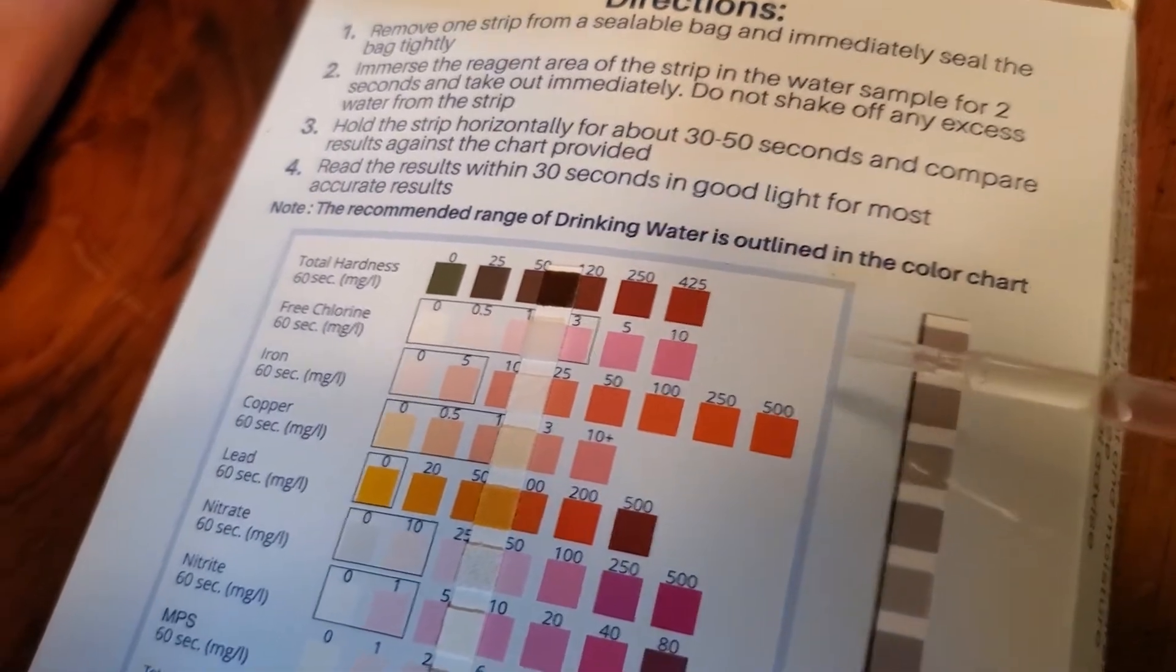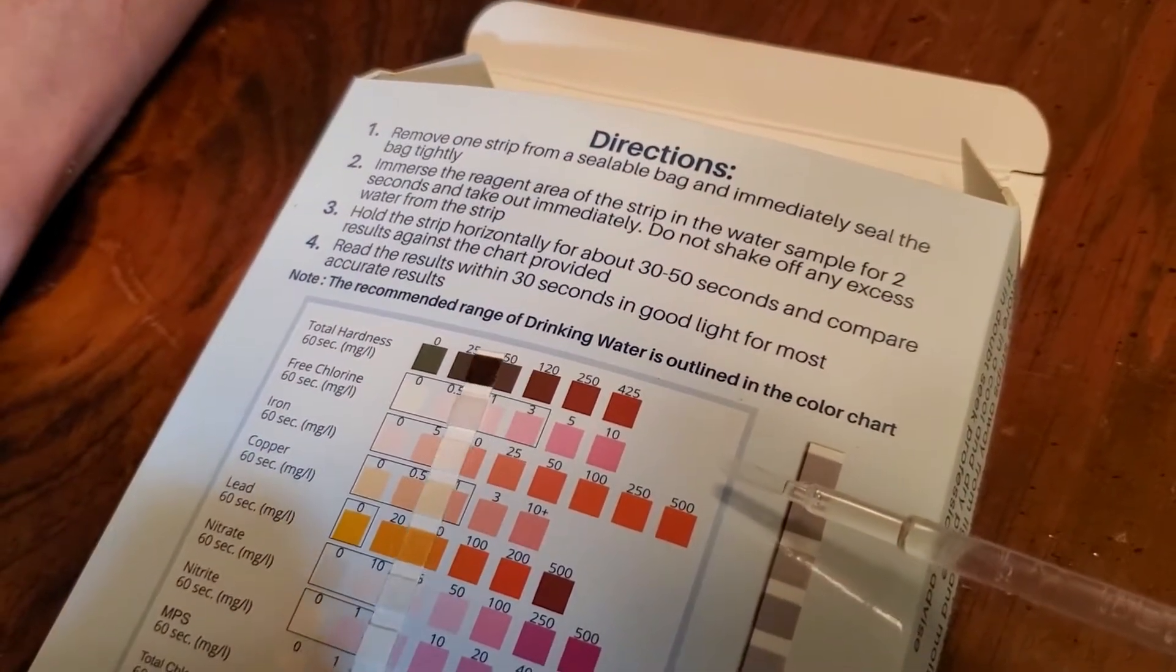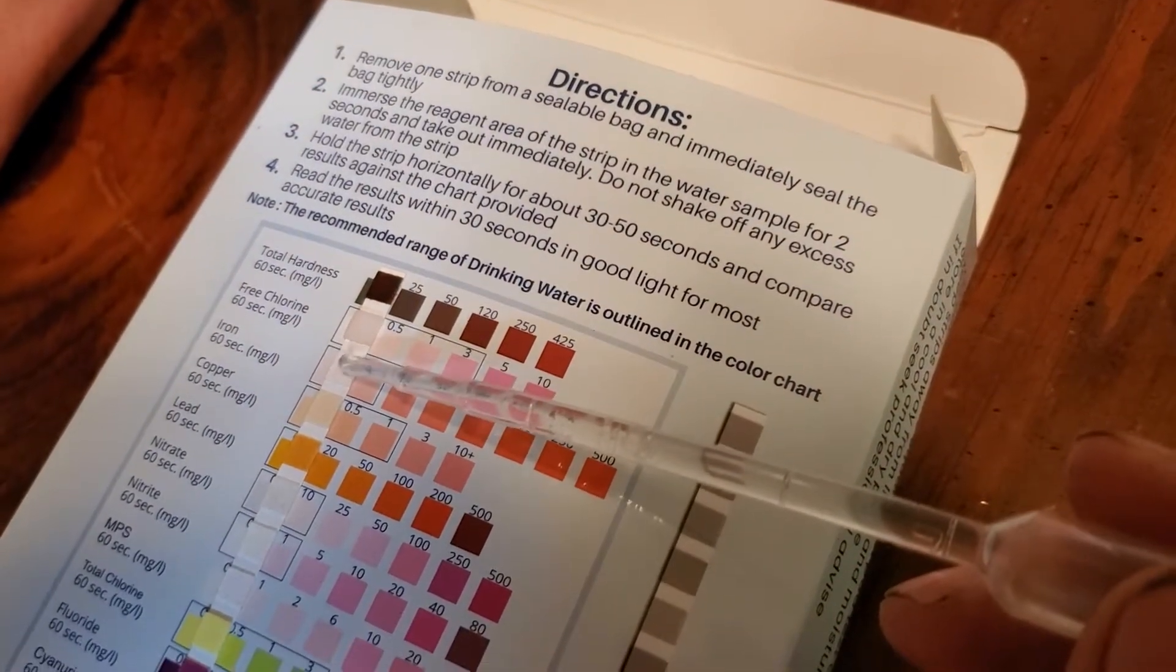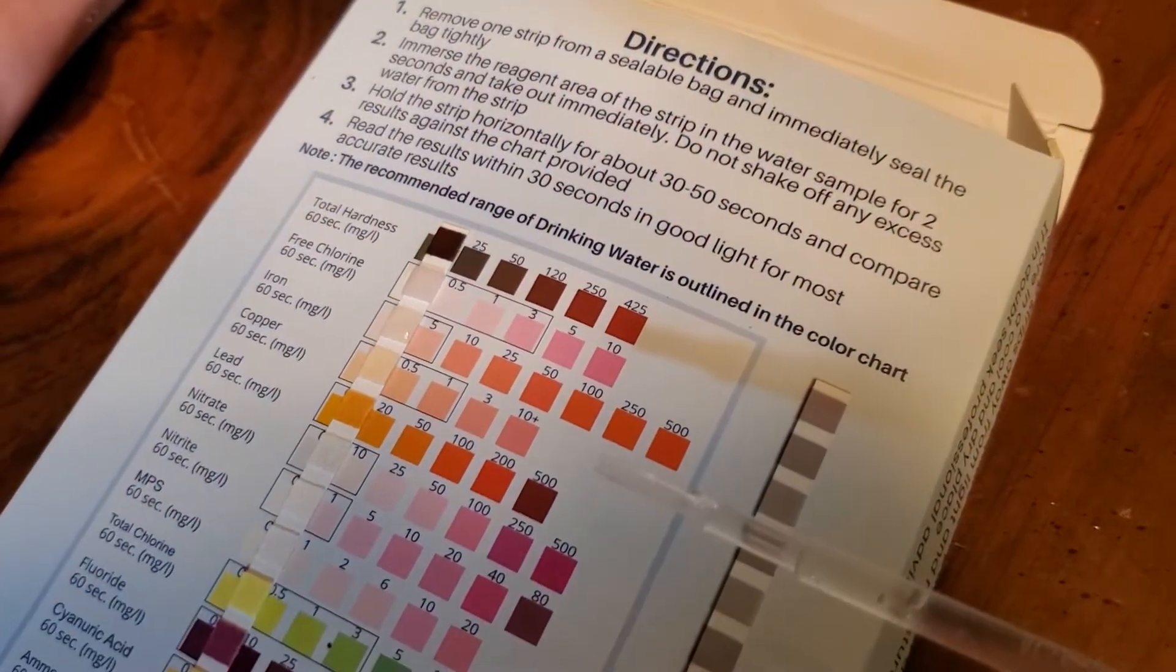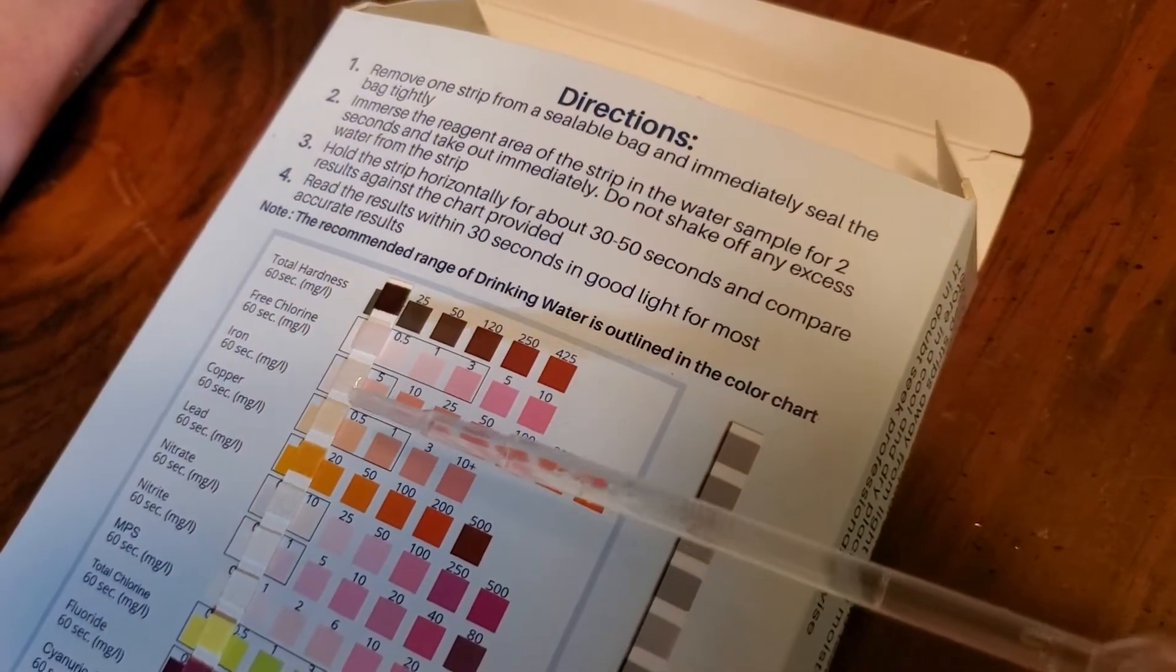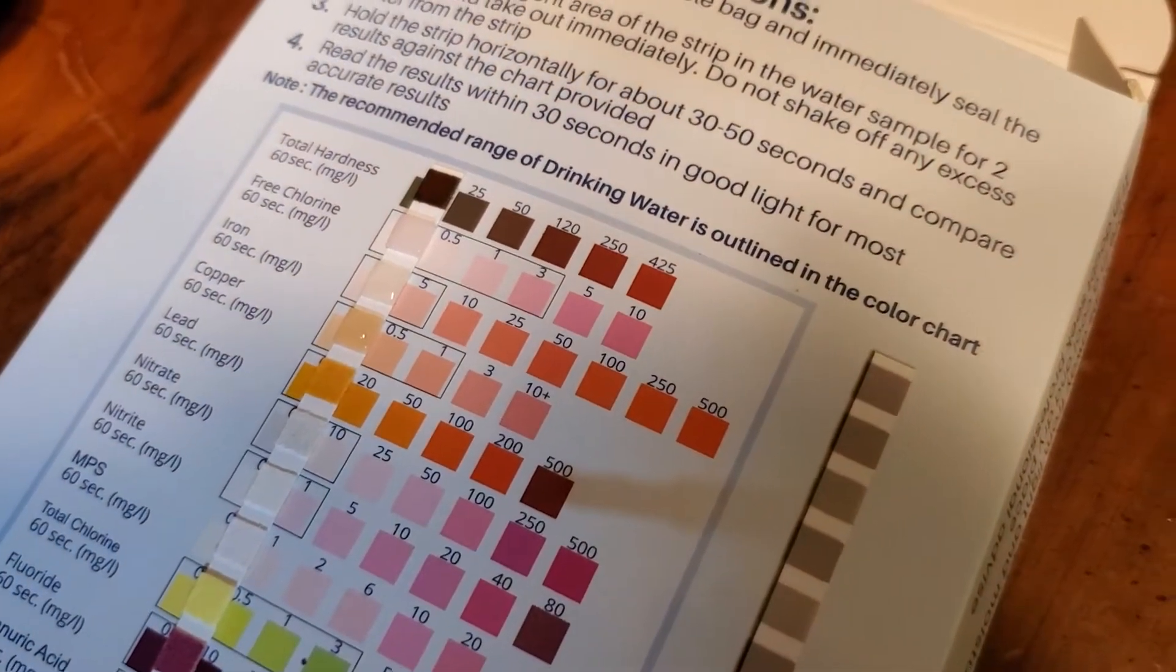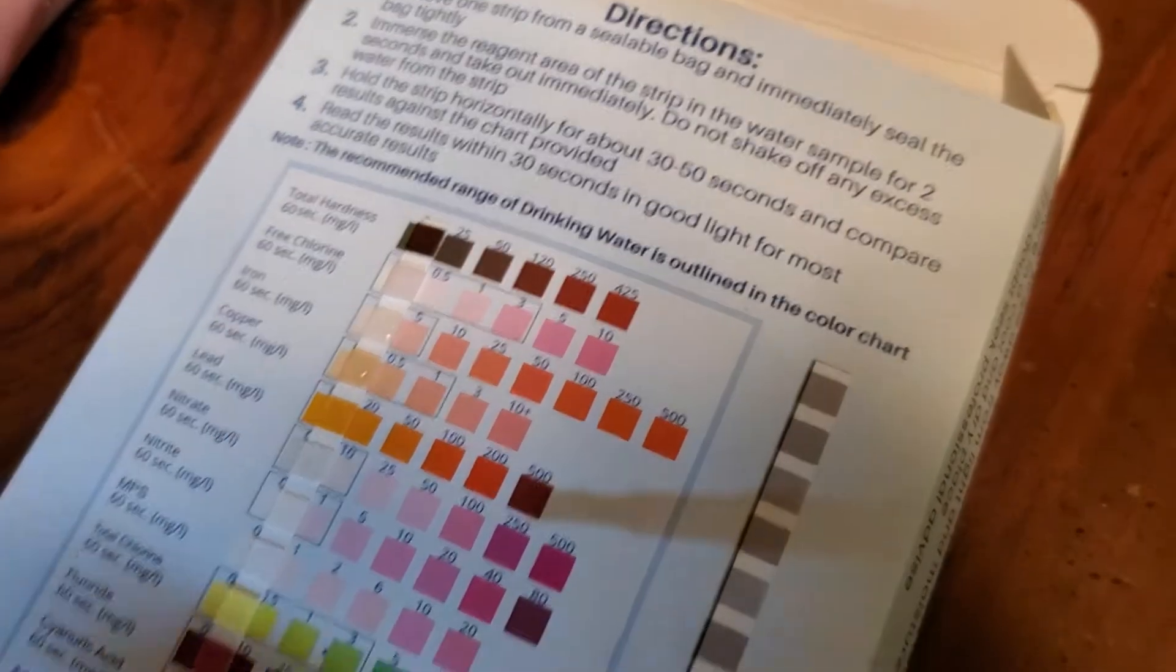Two drops here on the chlorine. The boxes show you the appropriate range. This is pretty much at zero I think, not really gaining any color. Iron, as it sits they will get darker which is why you've got a time limit. It looks to be right there in the zero to five as well. The next one is copper. That looks closer to the zero.